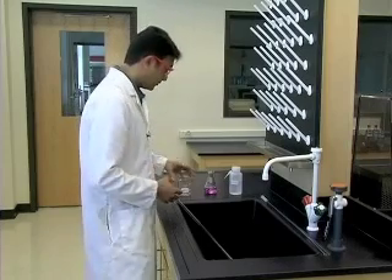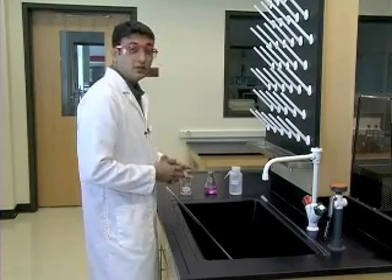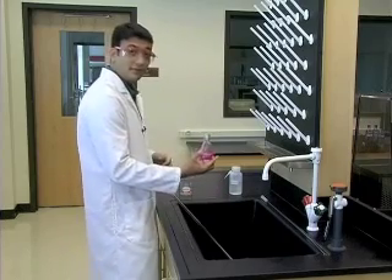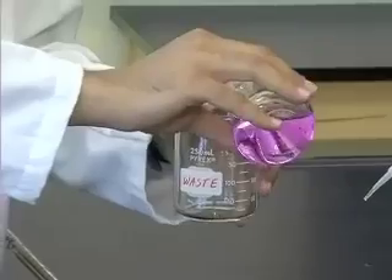In our case, we're going to use this waste beaker to contain the waste. First, pour the contents of the flask inside the waste beaker.